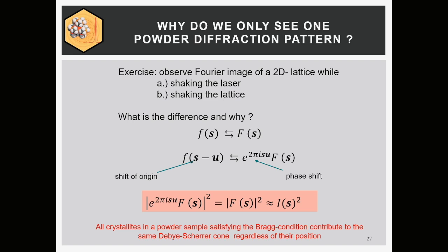There's often the question from students, say, hey, when there's a powder, this is not one crystal, right? These are millions of crystals. Let's assume, what was the example? I think 7 million crystallites. Maybe 1,000 of these are in reflection conditions, but they are in different locations. So you would expect each one gives diffracted intensities, but they're all separated in space, even if it's only 1 millimeter. That would mean the peaks are very broad, but the peaks are not broad.